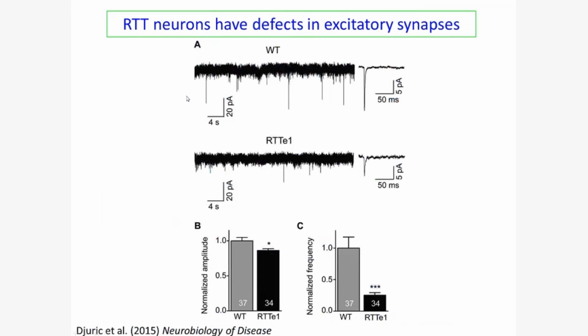Essentially, Wenbo is recording all of the excitatory electrical information entering the neuron he's interested in, and all of this is plotted here as synaptic currents. Wenbo can analyze not only the number of synaptic events, but also the size of the events, which can give us insights into any neuronal dysfunction that occurs. When we look at the amplitude of these individual synaptic events, Wenbo found a modest but statistically significant and consistent decrease, suggesting decreases in the actual strength of synapses.